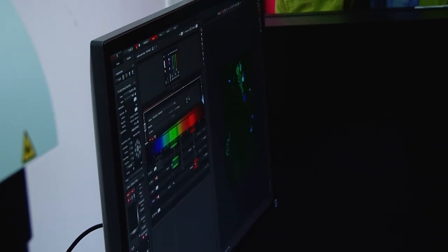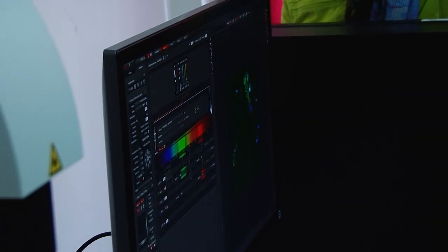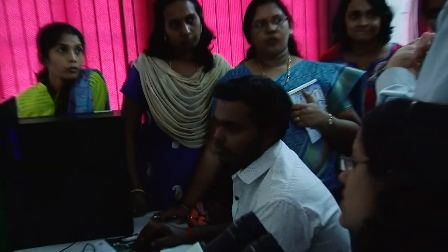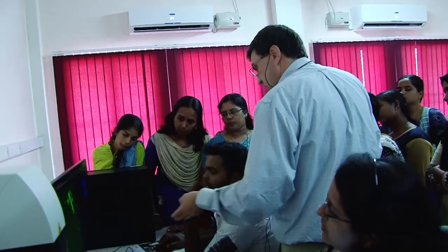And somebody was asking me the other day, like if you used Alexa 488 and you put it in a publication and you didn't do it as green, yeah, it's probably good to write in a figure legend pseudo color red for clarity or something like that, because sometimes you want certain colors to go together, maybe not the colors people would think of, but it's a good thing. Okay, and then again, he could measure, he could do different things with it.